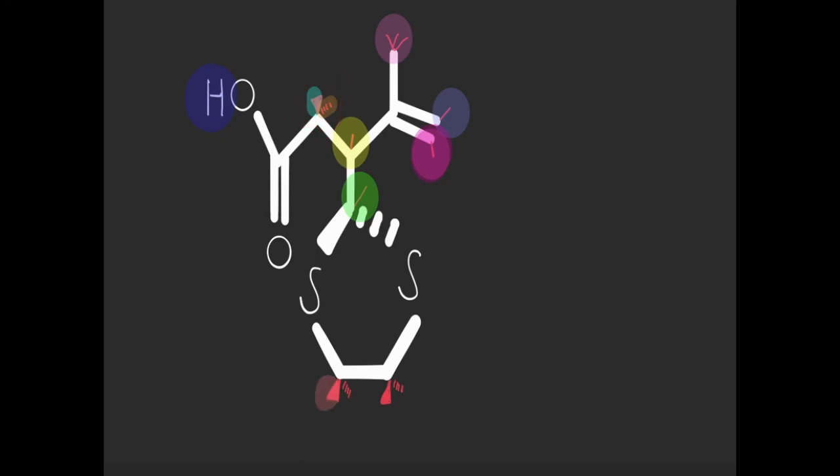This would be yet another different signal. This would be another different signal. This would be another different signal. None of them are the same so far. They're all different. So this would be another different signal. So in total, there are 1, 2, 3, 4, 5, 6, 7, 8, 9, 10, 11, 12 different signals in this molecule. The reason why all of these are different, so we see that this sulfur sticking out is in the front, and there's a sulfur sticking out in the back.